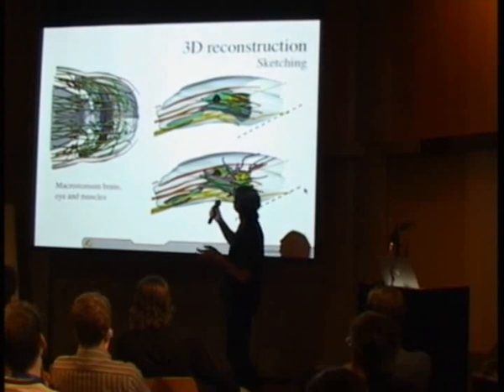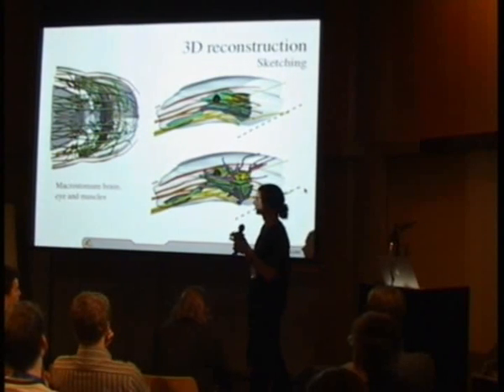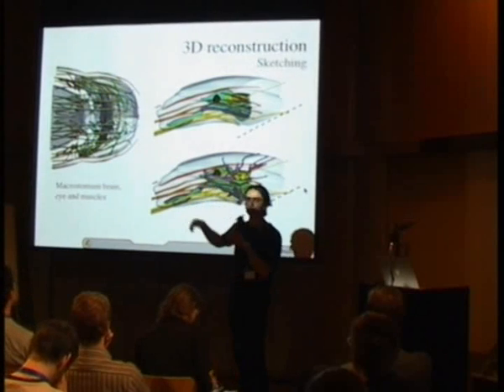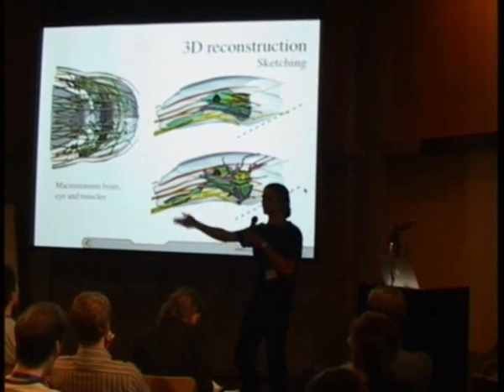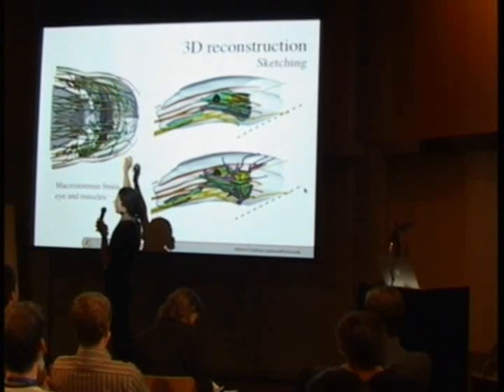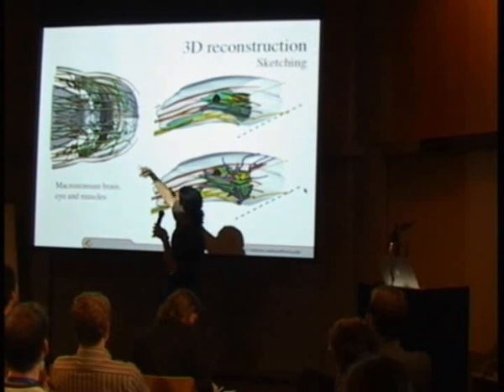And so also using this approach of tubes and manually segmented meshes, we very quickly generated this map of this invariant pattern of muscles in the dorsal skin and the ventral skin. Just some details: this is the anterior part, this is the head of the worm. In blue here is basically the brain, and in black you have the eyes.